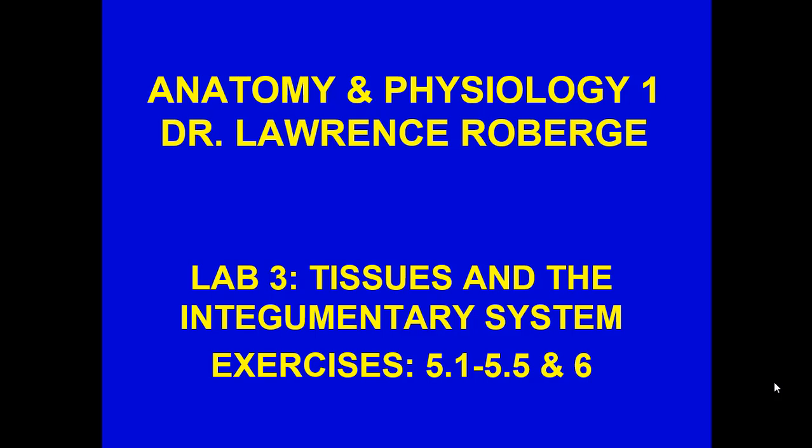Okay, welcome. This is going to be Lab 3 involving tissues, basically histology, and the integumentary system. Exercises are focused on the Syracuse lab text 5.1 to 5.5 and also exercise 6. When you do the filling out of the handout sheets, you will need to complete through 5.1 to 5.5. We'll do the subsequent sections when we get to the muscular and to the nervous system. So let's get started.